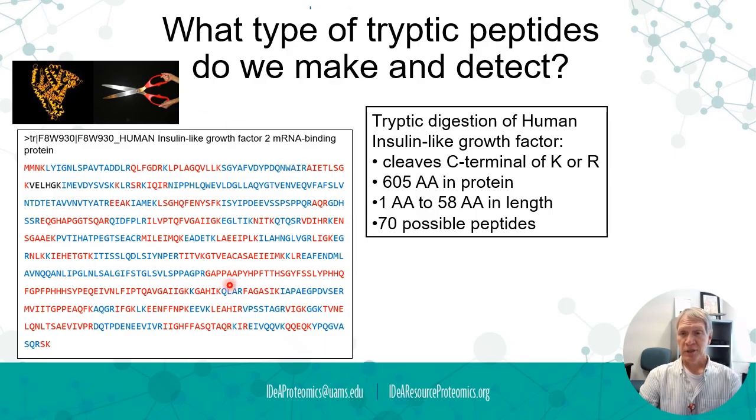Now, some of you at this point are going to say, oh, no, hold on. You said there are tens of thousands of proteins, and now you're going to add this trypsin and you're going to create hundreds of thousands of peptides.